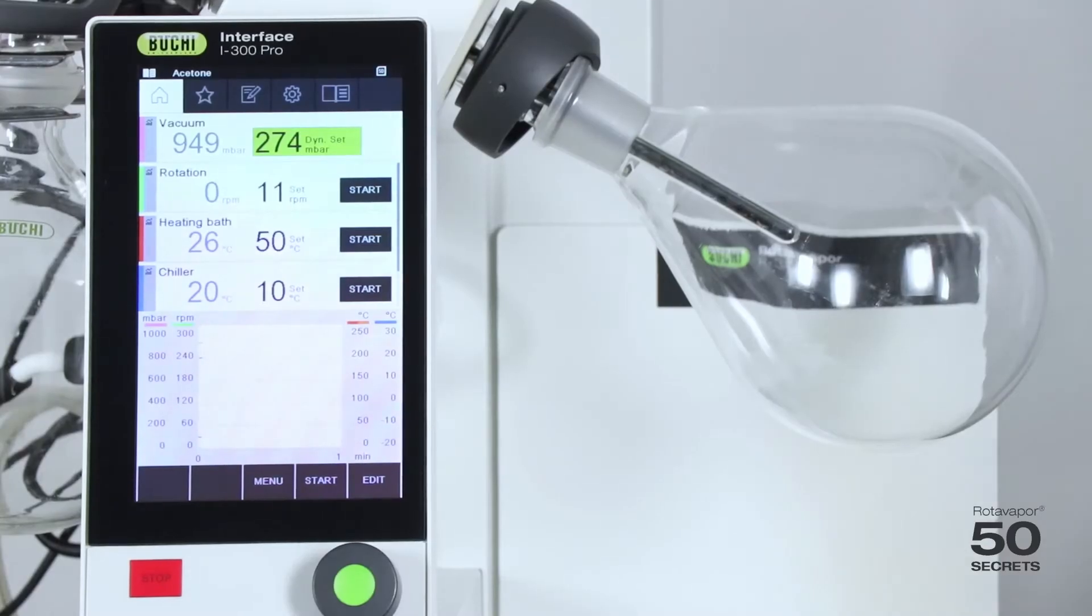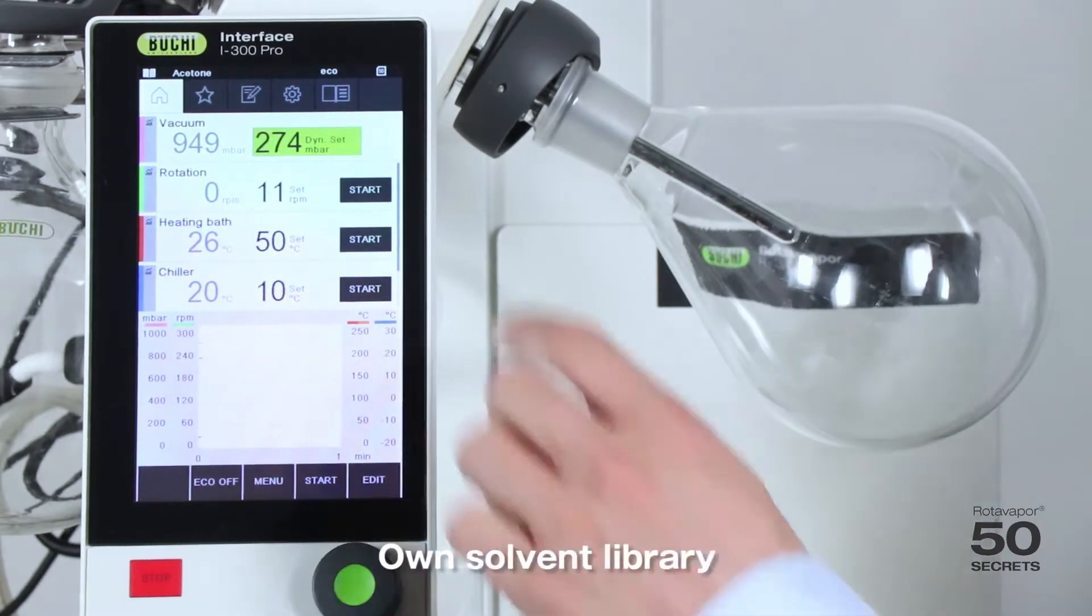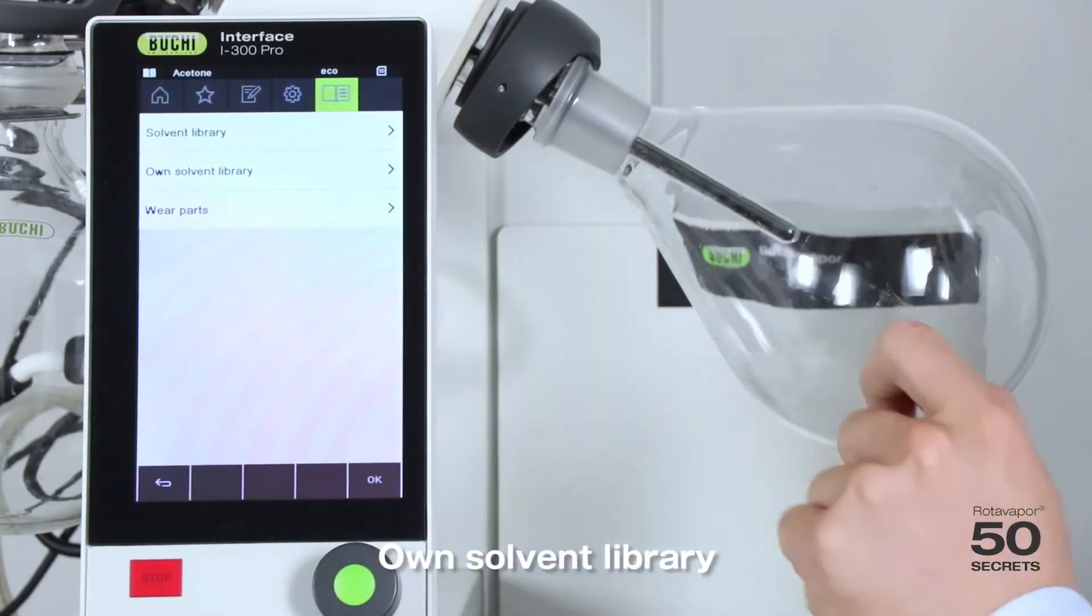In addition to the inbuilt solvent library I would like to show you another feature only the i300 Pro has, which is the own solvent library.